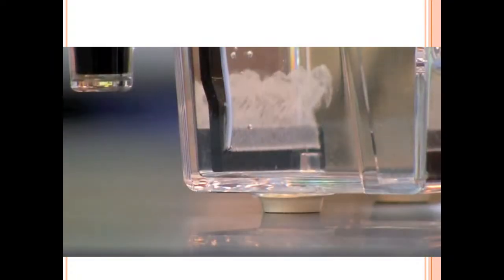At this point, you should be able to see bubbles coming from the wires at each end of the gel box. Notice that the positive or red electrode has fewer bubbles than the negative or black electrode. In a few minutes, you should see the samples begin to migrate from the wells into the gel. Notice as your DNA samples run, the dye front moves from the negative electrode towards the positive electrode.